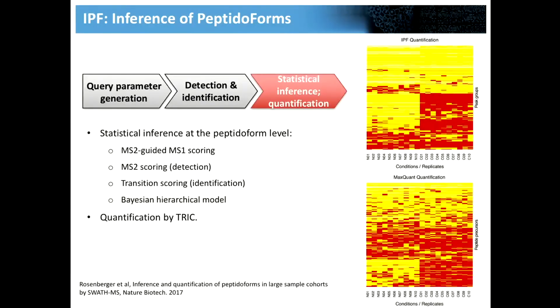I'll be happy to try and explain, but George is probably the expert. So I think at the moment what he's doing is doing an open modification search usually in front, for example, in DDA. So it still requires a library, right? And so what he's been doing is doing open modification searches and then looking for what modifications are there and then refining this in the DIA data with this model. But if I understood him correctly, he's asking if it's done in this step, and your answer is it's done in this step, right?